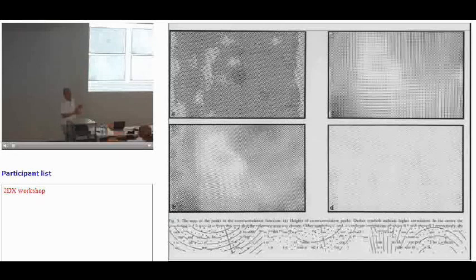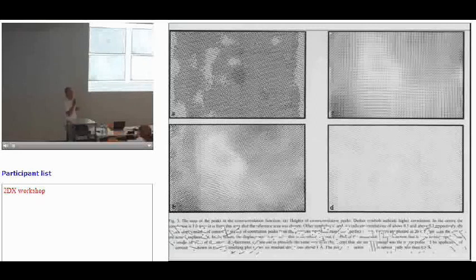So this is the unbend. It was actually a square area, but we've taken this. So the reference area was cut out of the middle, and you can see it's about 10 unit cells square. It's about 100 unit cells. The molecular weight of that bit being used in the unbending is about 10 megadaltons. So 1 unit cell is 3 molecules, so it's about 100 kilodaltons. So 100 unit cells is about 10 megadaltons. And we're using 10 megadaltons to cross-correlate the whole micrograph and find where the unit cells are.